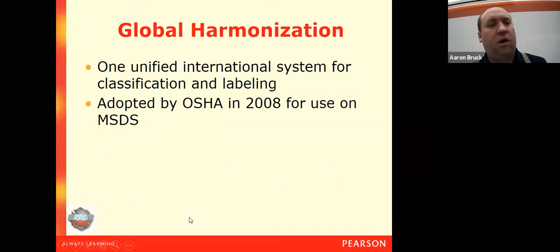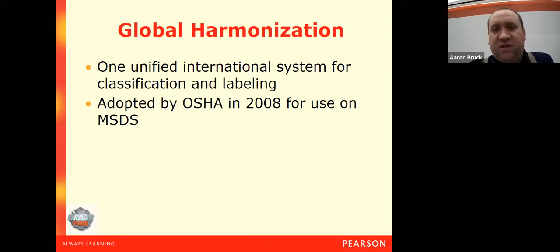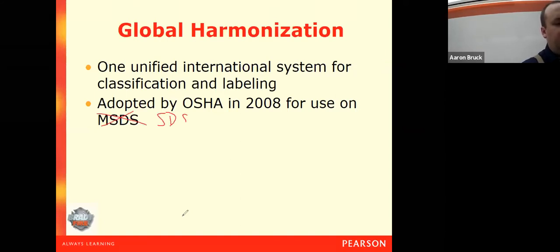So we come now to the Global Harmonization System. Global Harmonization System is a unified system for international labeling standards and classification. It was first adopted in 2008 for use on MSDS by OSHA. We are going through a rather long and drawn-out process of converting. And so one of those steps of conversion was to convert MSDS into SDS, the safety data sheets.